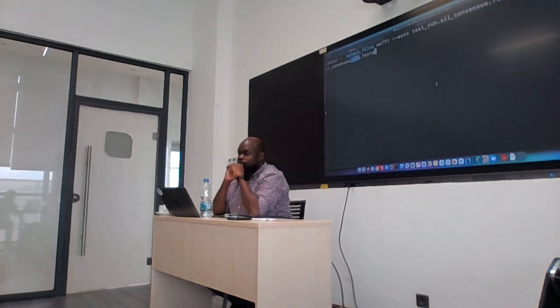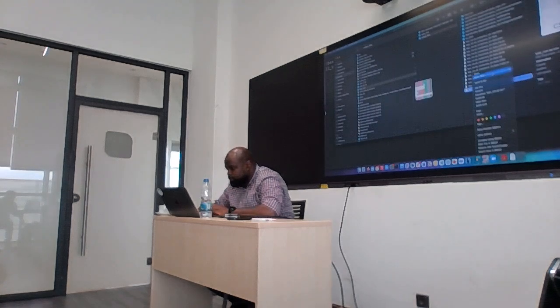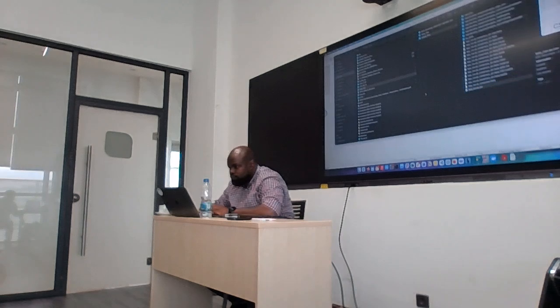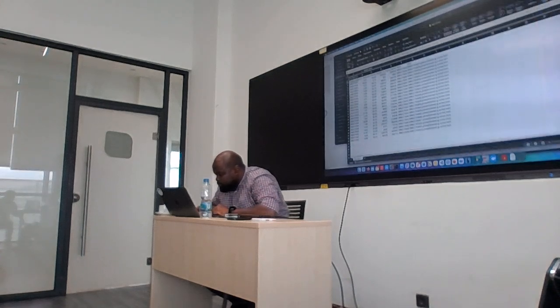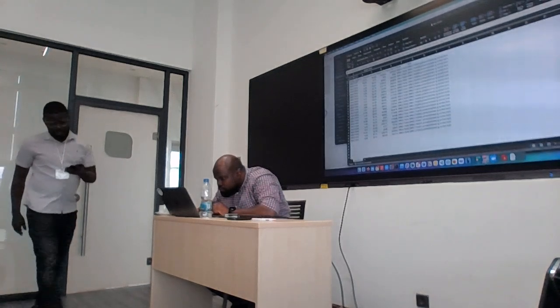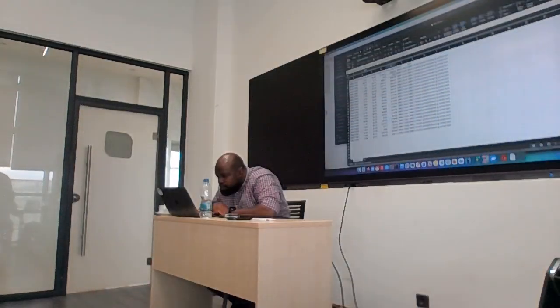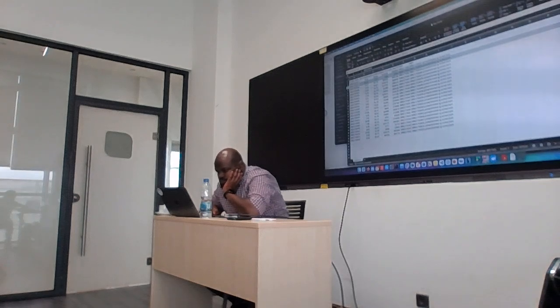So from our output, when you look at the QC, you have these two samples, you have 80%. There's one that ends with 89.